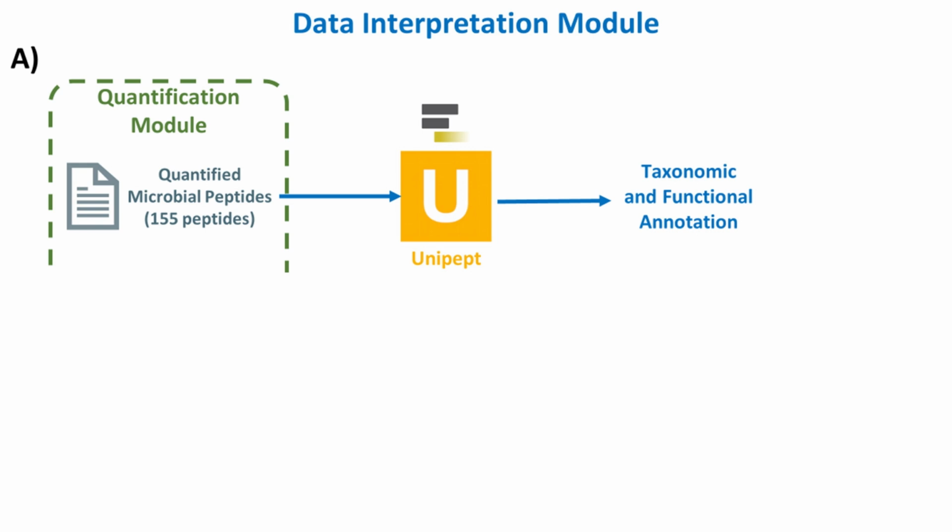This facilitates the identification and quantification of microorganisms within diverse environments using comprehensive and up-to-date information for annotations. Unipept also allows for comparative studies across samples, conditions, or time points, which can give insights into the dynamic responses of microbial communities in response to environmental changes.